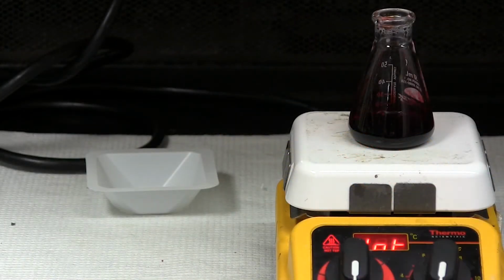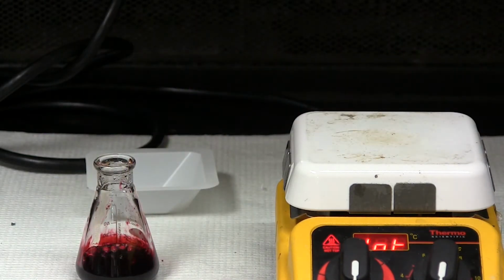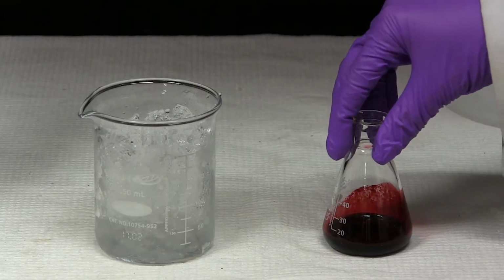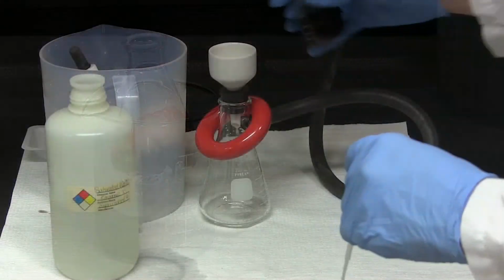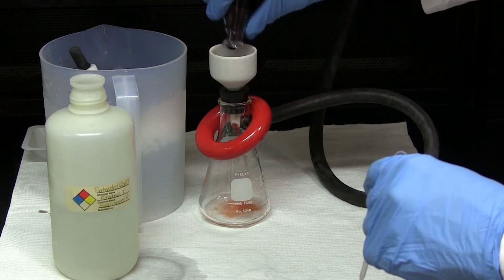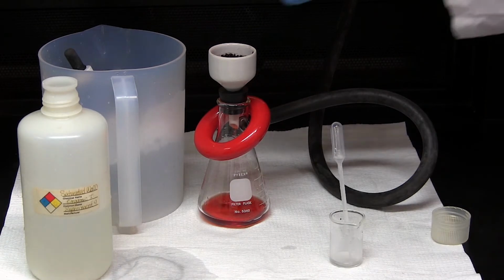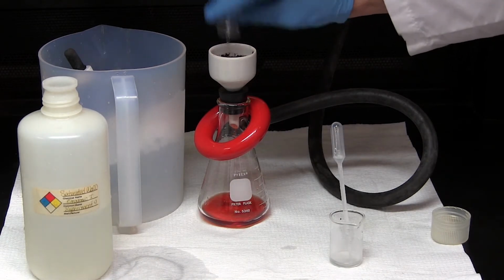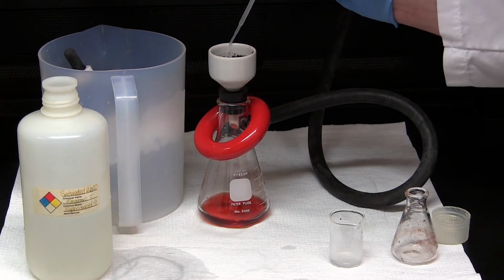Remove the heat and allow the flask to cool to room temperature. Next, place the flask in an ice bath for 10 minutes. Vacuum filter the contents of the flask and wash the crystals with no more than 10 milliliters of cold, saturated sodium chloride solution. Collect the crystals and store for drying. If crystals are not obtained, save the filtrate.